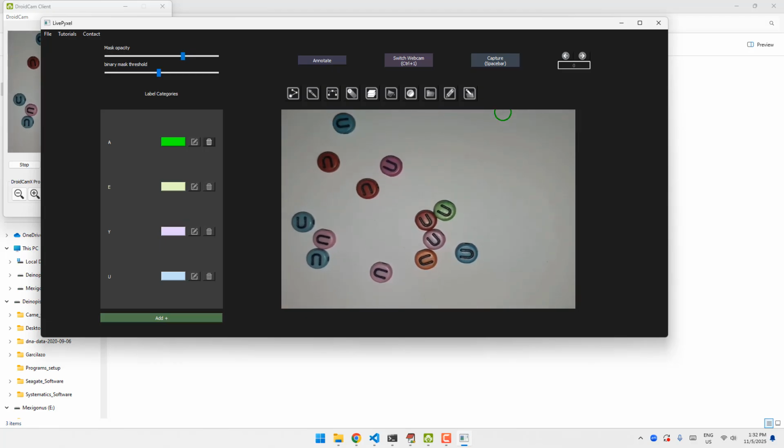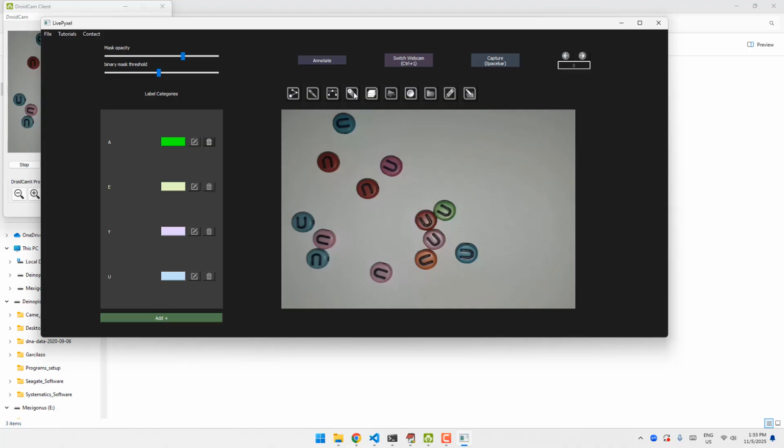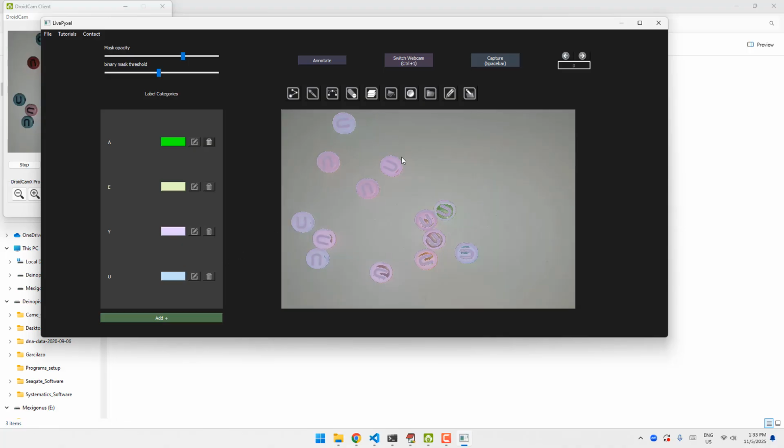but shells. So in that experiment, what we did was taking each of the images with their different masks and using those masks to create transparencies of the original images so that everything but the background is visible for each category for each of the images. And then we started putting them on top of each other. With that, we were able to create a very large dataset of over 10,000 data points.